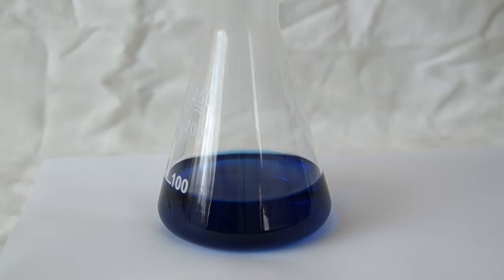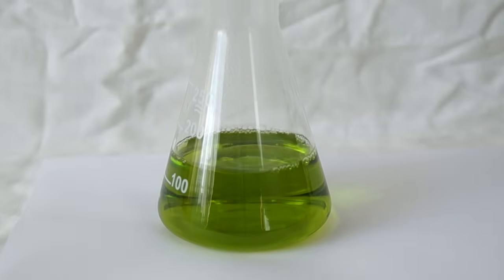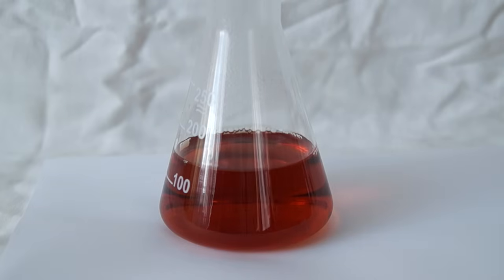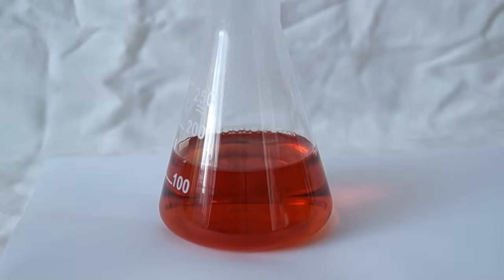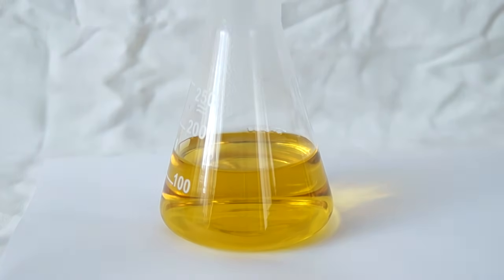Afterwards we pour alkaline solution of glucose into the flask and observe beautiful changes of color. First the solution becomes green and then it turns red and eventually becomes yellow. These colors are reminiscent of traffic light colors red, yellow and green.